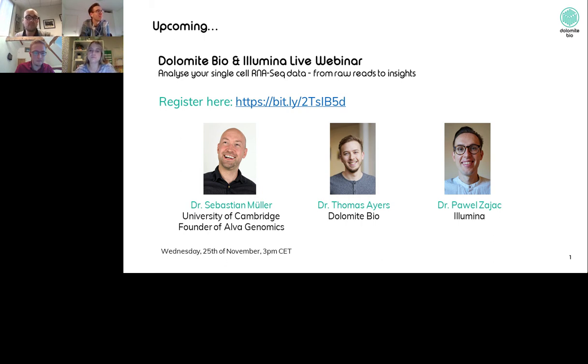So I can answer that question. The first thing is actually getting your protocol optimized to try and minimize the debris in the first place. And this can actually be done by modifying the different types of buffers that you have. Because what we found is you can get away with some amount of debris within that sample as long as the debris is small enough.